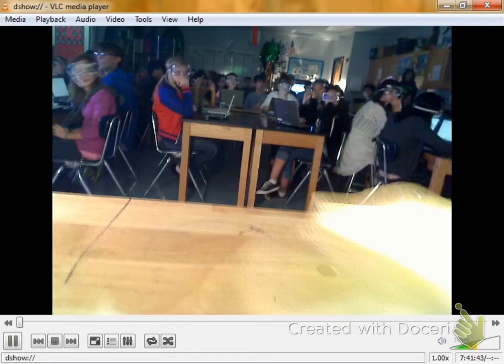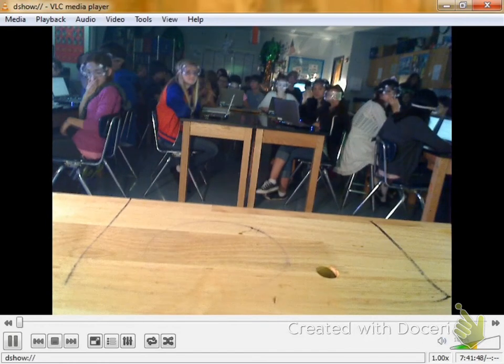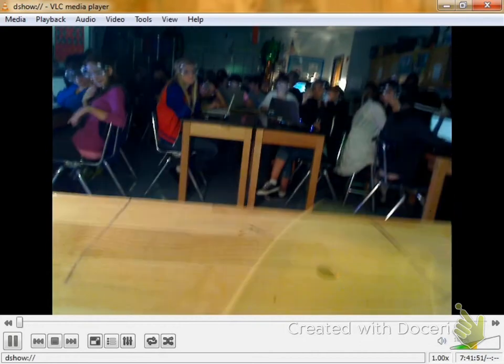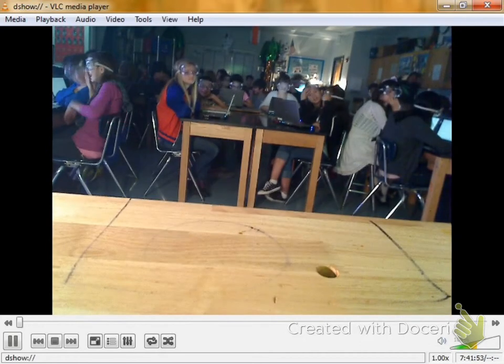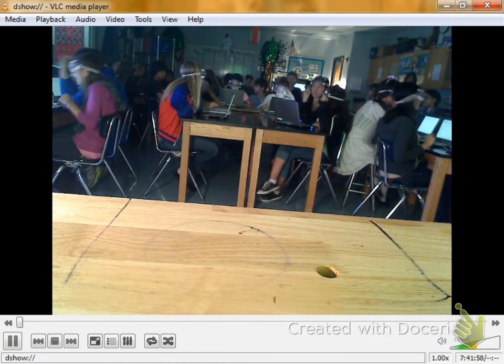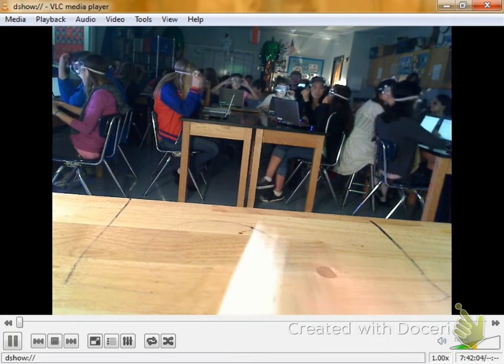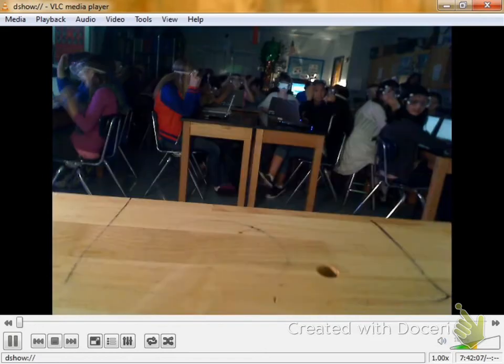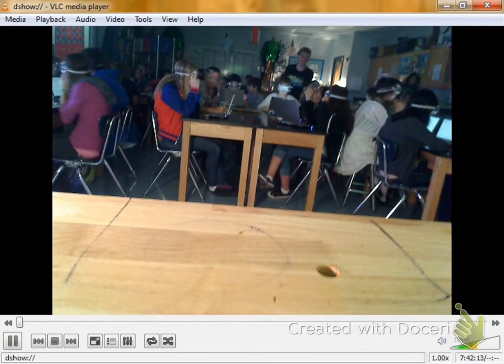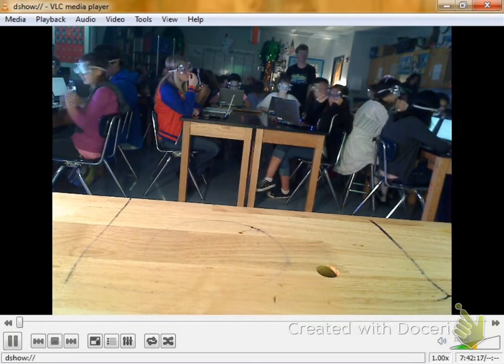Guys, it's not smoke, it's just gas. It's hydrogen gas. Same stuff you breathe. It's okay. I hope you're all writing your observations right now.